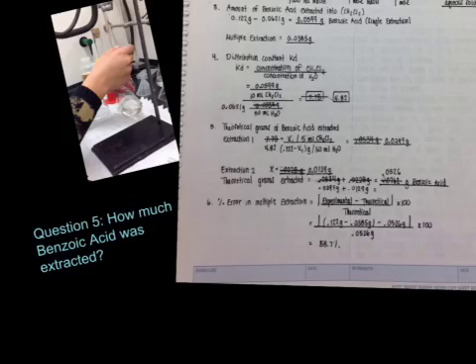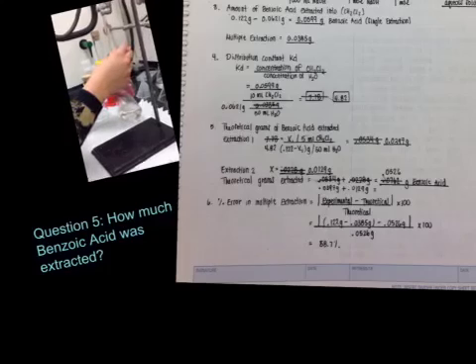We were able to calculate the amount of benzoic acid extracted by separating the two immiscible layers, aqueous and organic, taking out the organic layer first, leaving the aqueous layer within the separatory funnel. After that, we were able to titrate it, as shown in this video. And knowing how much NaOH was used within the volume, we were able to calculate the mass of benzoic acid within the aqueous layer, and we subtracted that from the total amount.